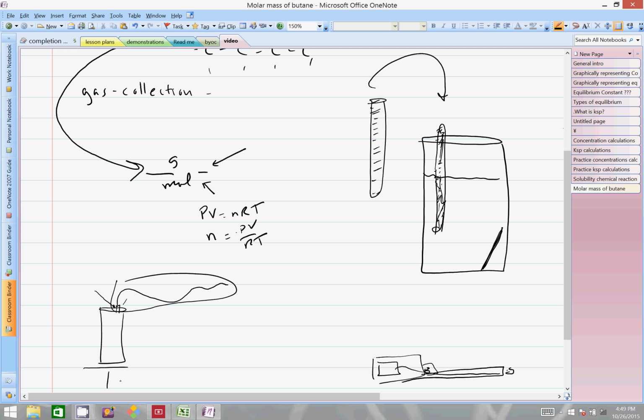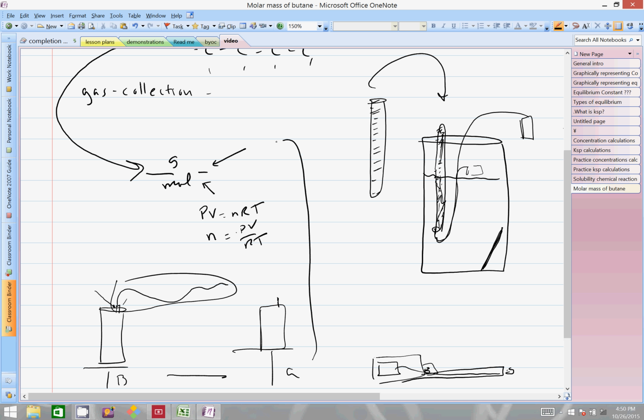And then as you dispense, it's not that long, but get this thing close to the surface and drop your tube in and dispense your gas. Remove it again, and with just the nozzle, weigh it again after. The difference between these weights is how much gas you utilized, and if nothing escaped, that's your top value, your mass.